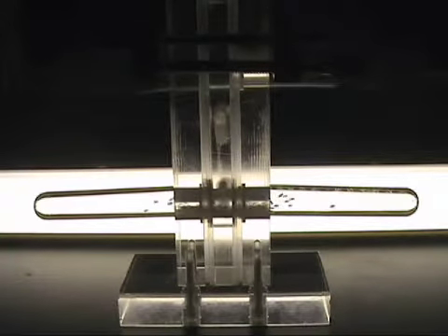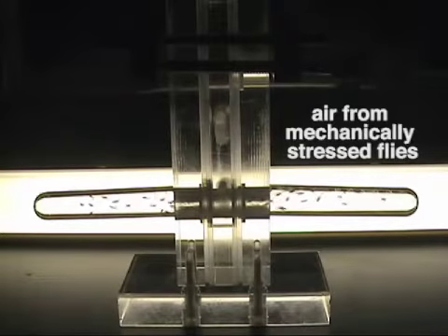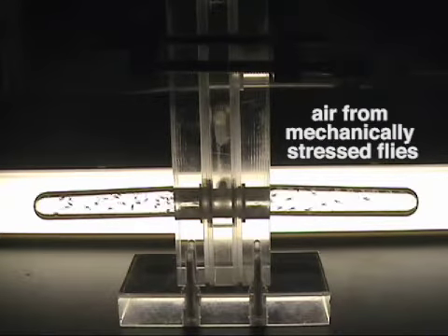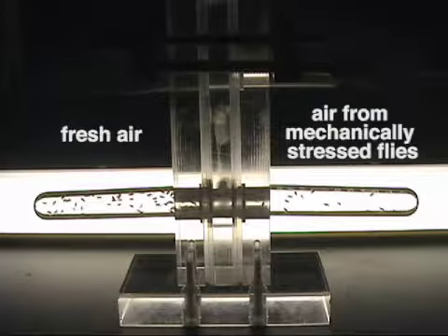In this experimental trial, the arm on the right contains air released from flies that were mechanically stressed by shaking. The arm on the left is filled with fresh air. As we observe, a vast majority of the flies choose the arm with fresh air. It is clear that the flies can detect and avoid an environment that contains the substance released by the shaken flies.